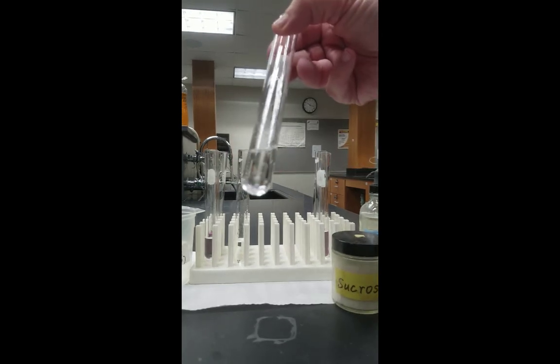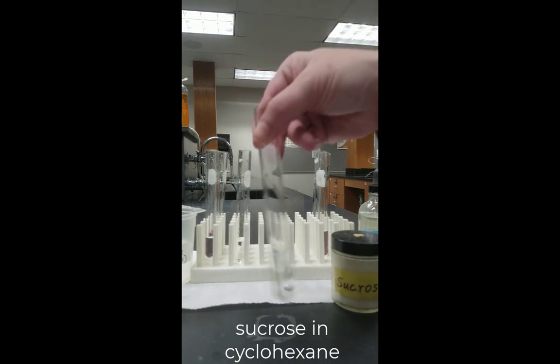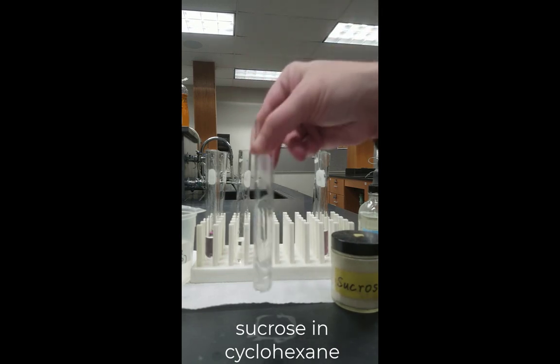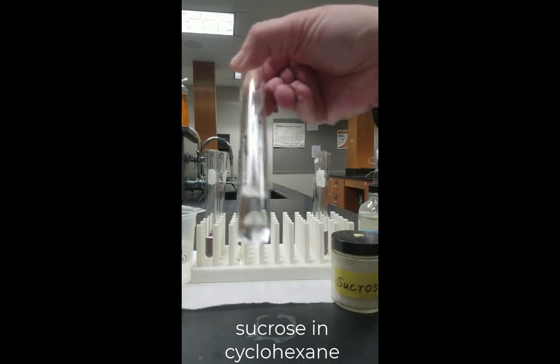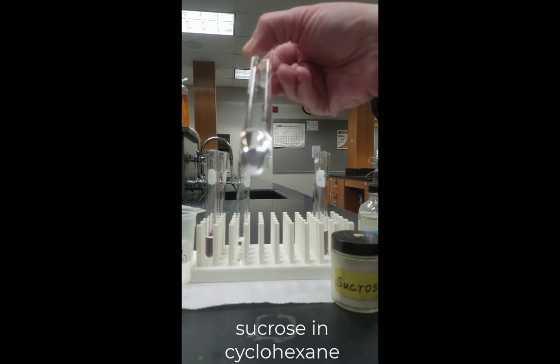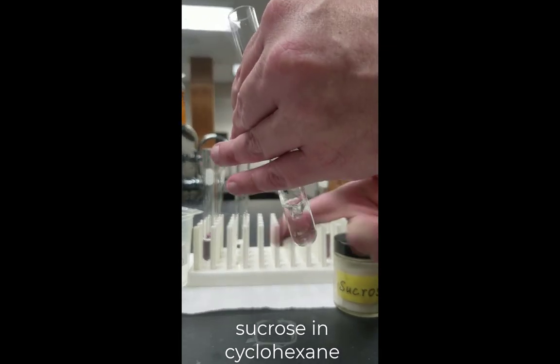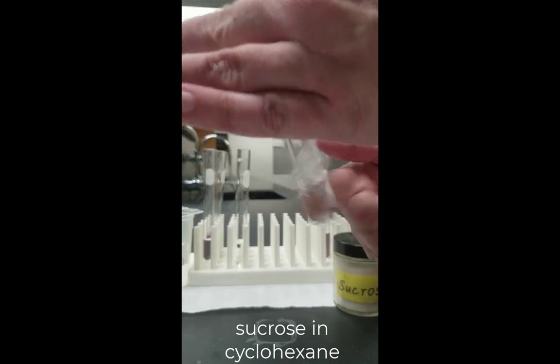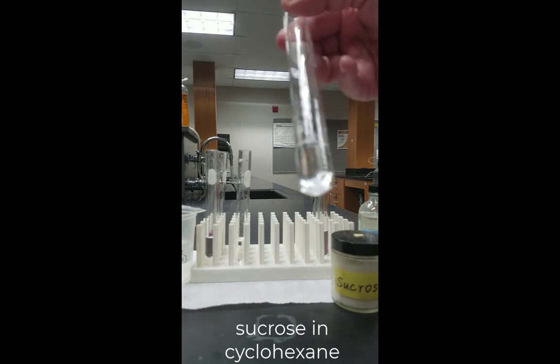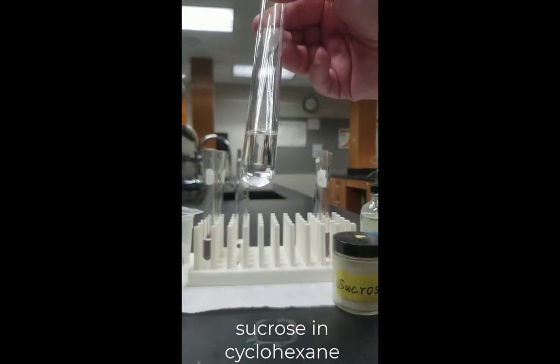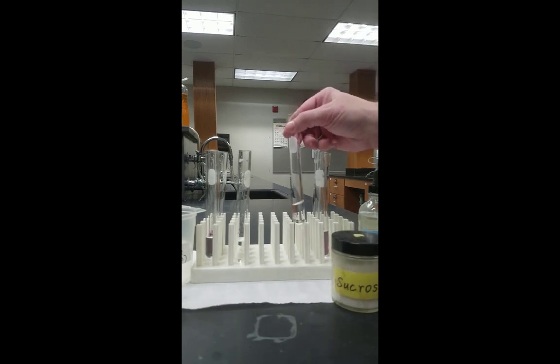Doing the same with the cyclohexane. And notice that there was some solid there in the bottom of the tube. Now give it some really good agitation. And if you look at the bottom, there still seems to be some solid. Now, whatever we did for the water, we really need to do for the cyclohexane. So again, we're going to give it a really good shaking, agitating there to see if that helps. And not really. If you notice very carefully, the solid sucrose still remains in the bottom of the test tube.